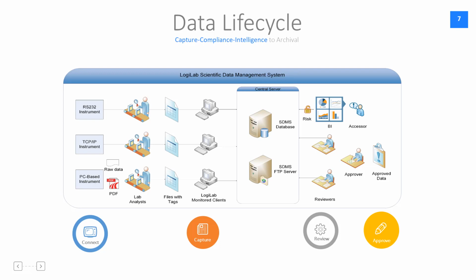Before we capture this data, the files can be tagged. There is a concept called tagging where we can record metadata related to the data about to be captured from the instruments. So you can have your own tags like which project, which batch number, which product for which you are going to generate data can be tagged and then captured.